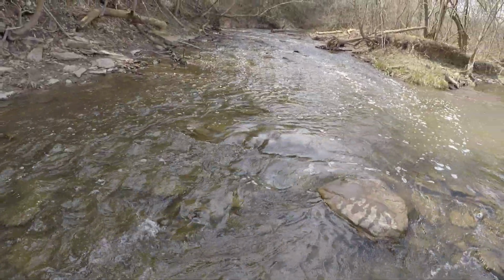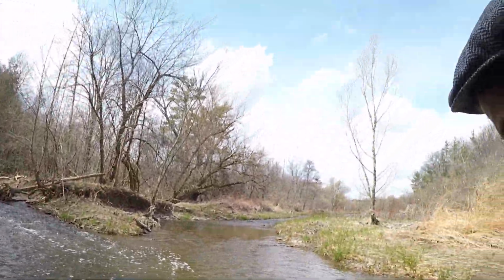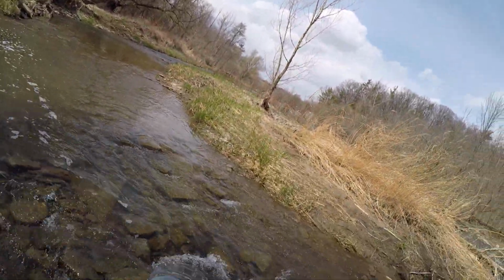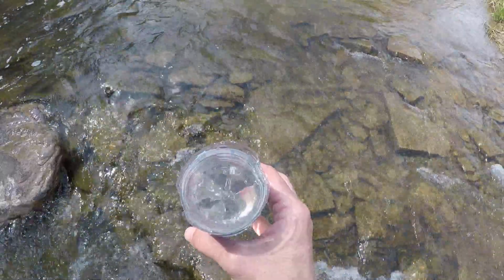The idea is if we kept filling it up and let's make it 14 feet tall, eventually there's enough suspended material that we won't be able to see it. Okay, so let's go over to this part of the channel and we'll see if we can get a little bit different reading. Collect here. Okay, again, I think it's going to be greater than 14, so this is not very turbid. I can see my marks in the bottom and we can move on.